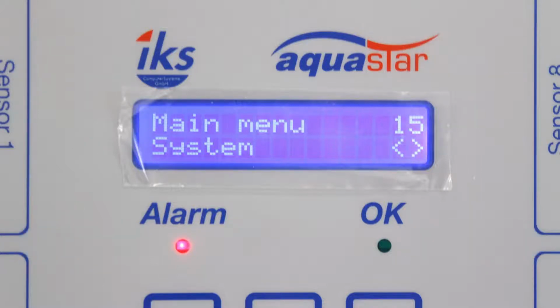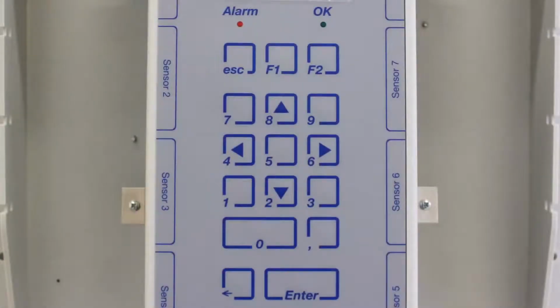Below the display are 2 LEDs. The alarm lights up when you are in the programming mode or when a pre-programmed value limit has been exceeded in control mode. The OK signals that the instrument is in operation, monitoring the aquarium according to the connected sensors, and carrying out the commands you have programmed. Below the LEDs are the buttons.